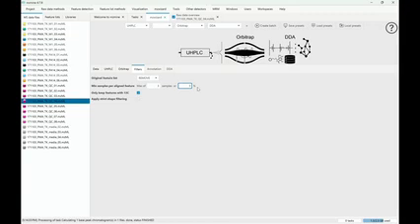So you can set this up, and here we're just going to go with 3 samples and 0%, but the percentage is quite nice if you scale your analysis. You go from, let's say, tens of samples to thousands, and then the percentage is going to capture that much better than if you say 3 samples. Of course, this filters out noisy peaks that we only spuriously detect in some samples.